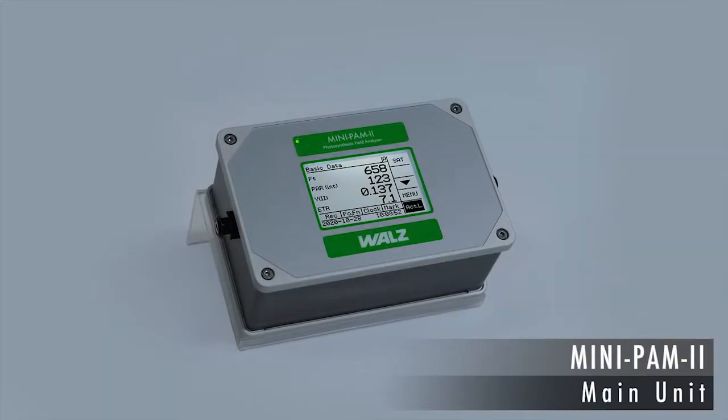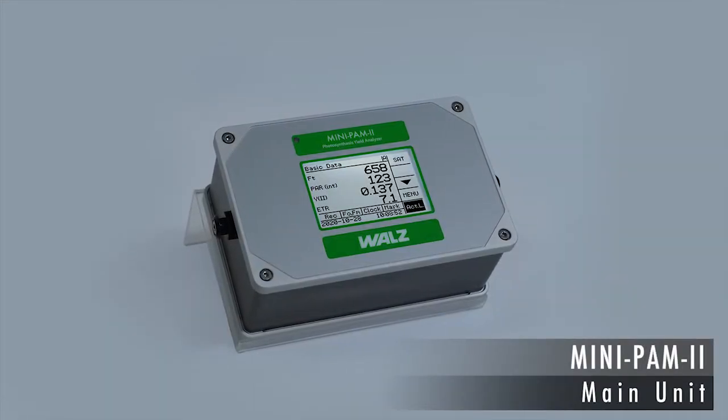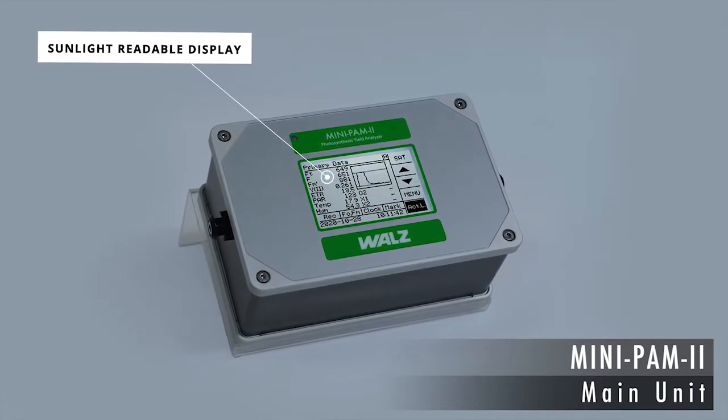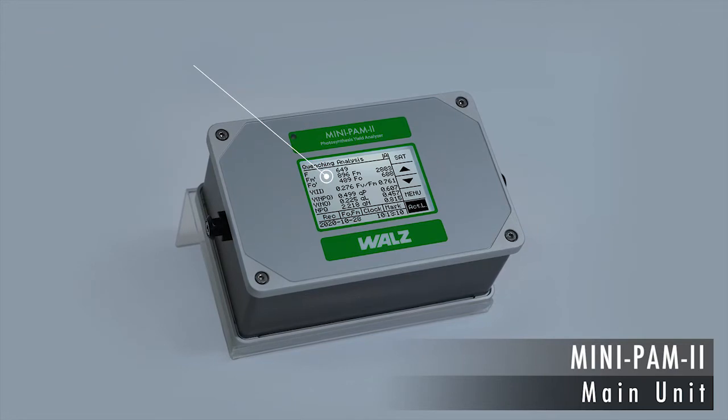All components are encased in the rugged housing of the MINI-PAM2. A sunlight-readable touchscreen serves as both an input and output device.